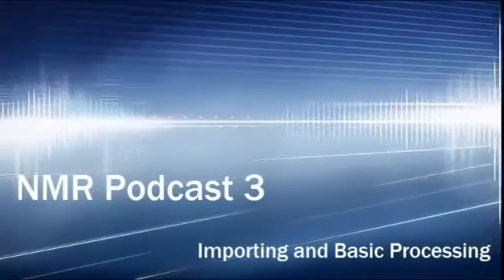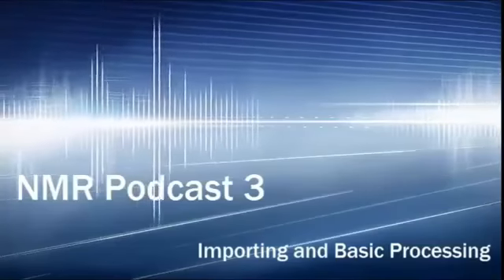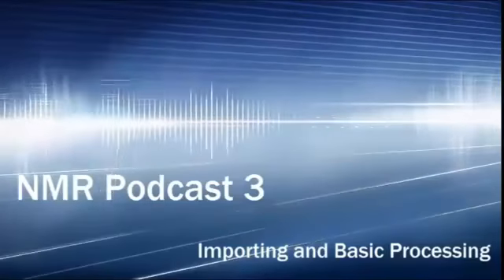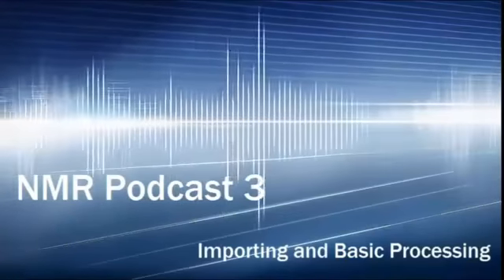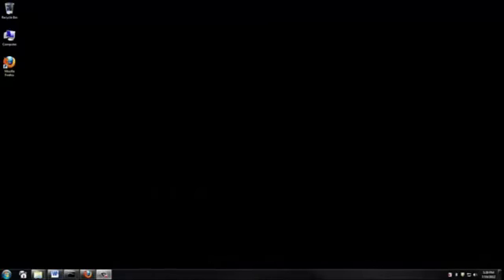Okay, so once the NMR has finished my experiments, I'm automatically going to receive an email that contains my data. This podcast is going to show you how to extract that data from your email and open it in TopSpin, which is our NMR software. I'm also going to show you how to do basic processing of your spectrum.